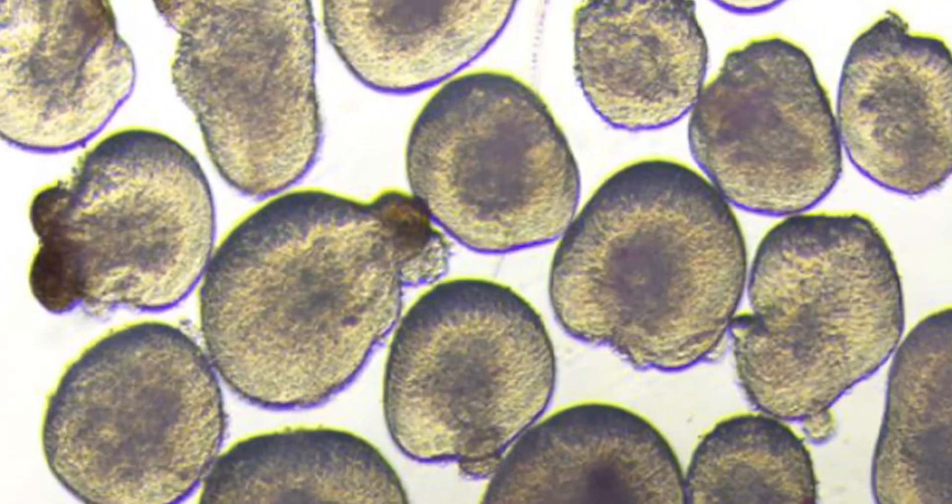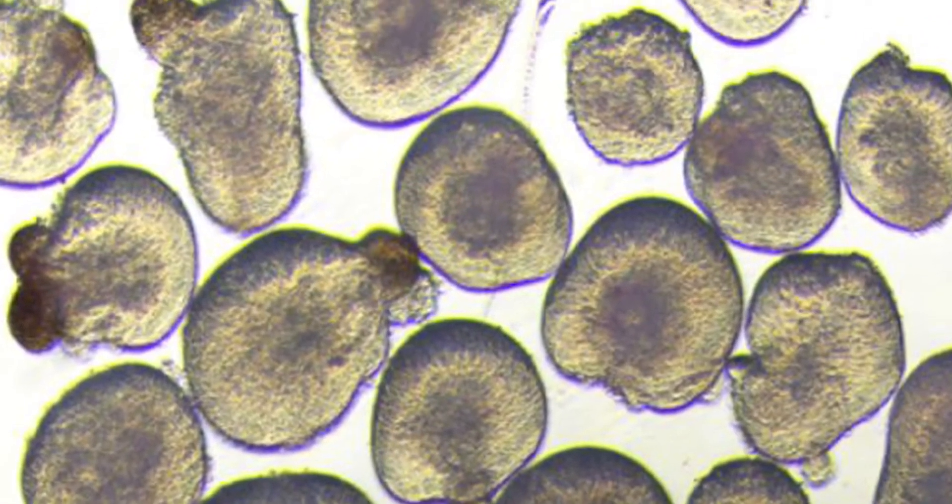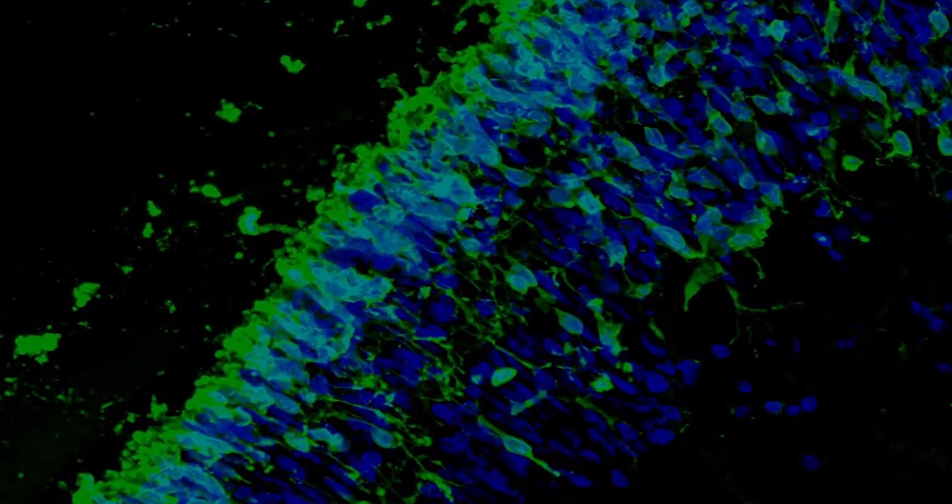Some of the highlights of our improved protocol include increased yield, decreased variability in organoid generation, and a decrease in the timeframe that it takes to generate mature photoreceptors by the order of about one month.